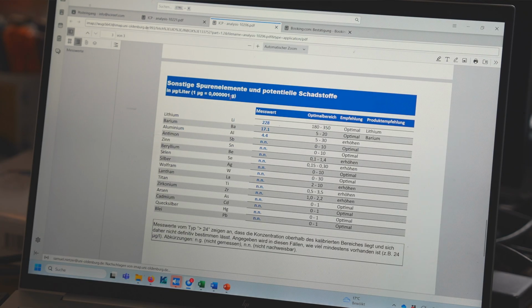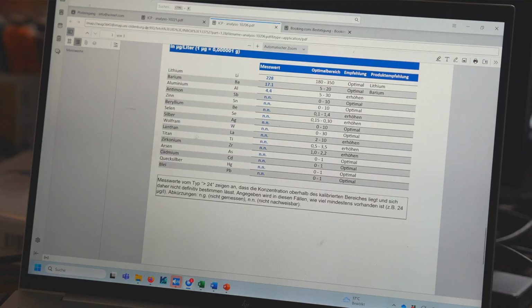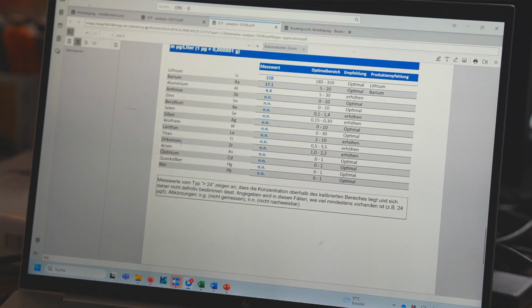The next category is the other trace elements and potential toxins. So some of them are physiologically relevant and important, also like selenium. It usually isn't really low concentrations, but is still necessary for certain processes, but it's not that super essential. Anyways, there's also arsenium. What's the English name for arsenium? Arsenic. We got arsenic, cadmium, mercury, and lead.